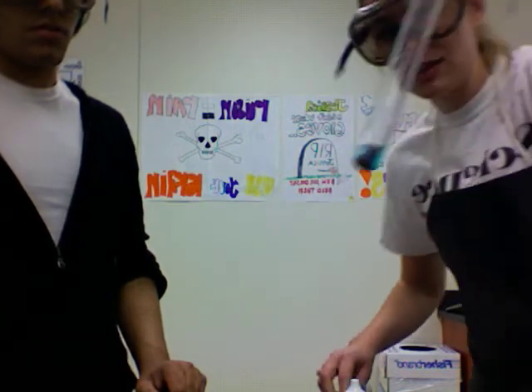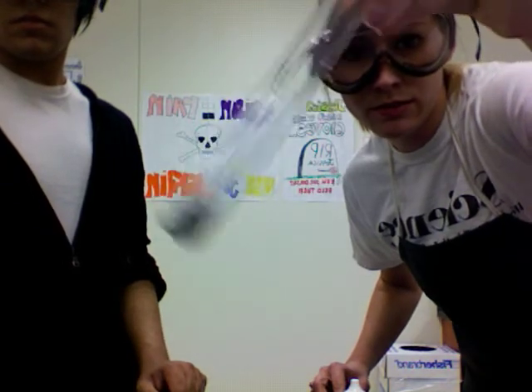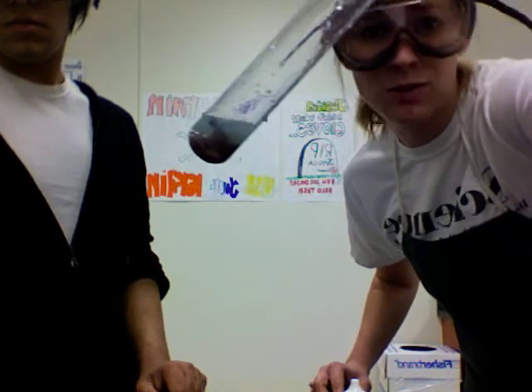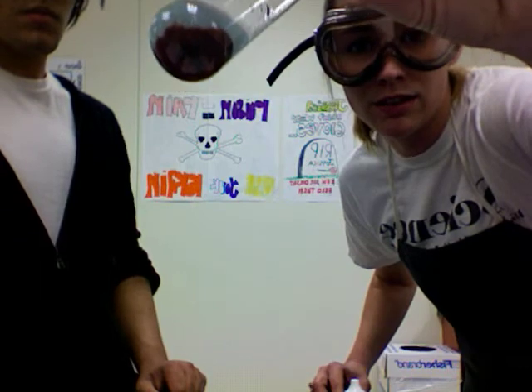Now I'm going to come back to this reaction. Remember, it was blue, and as we let it sit here, it's supposed to go clear. It's not blue anymore — it's clear because the zinc chloride solution is clear. And the copper, you can see, is that brown gunk all at the bottom.